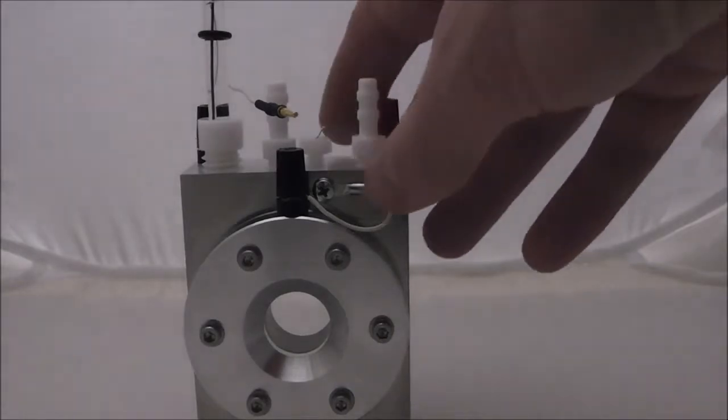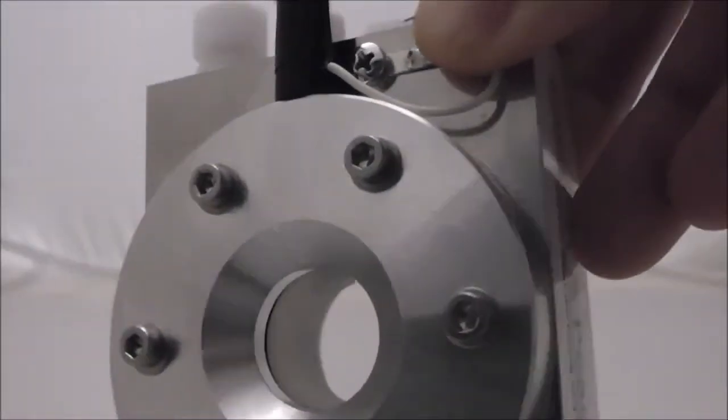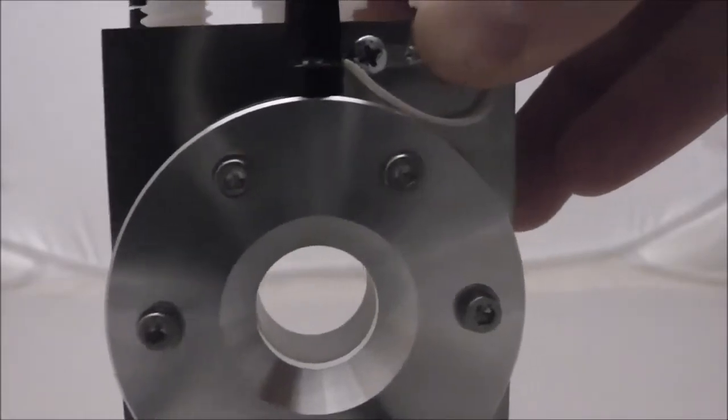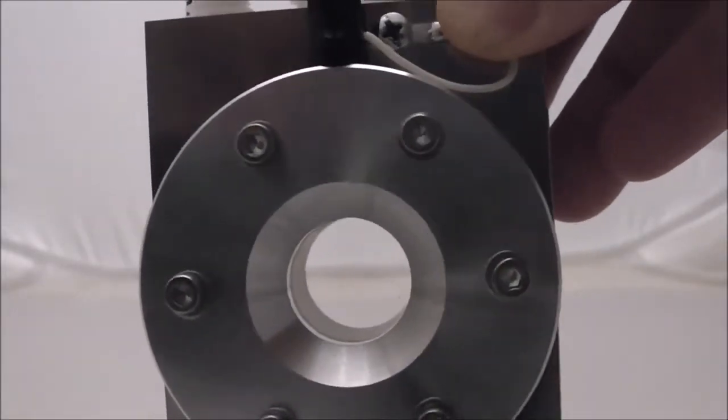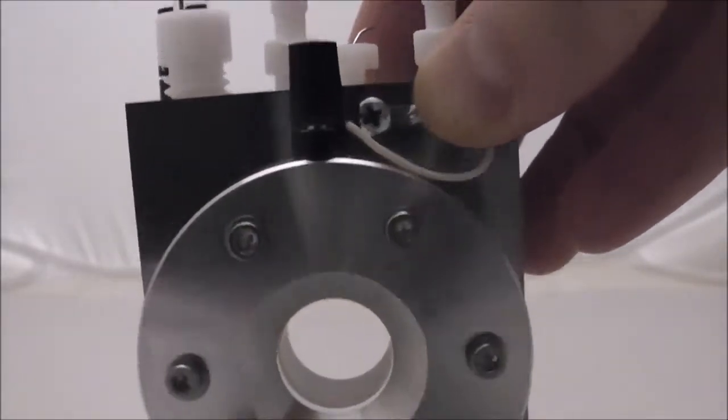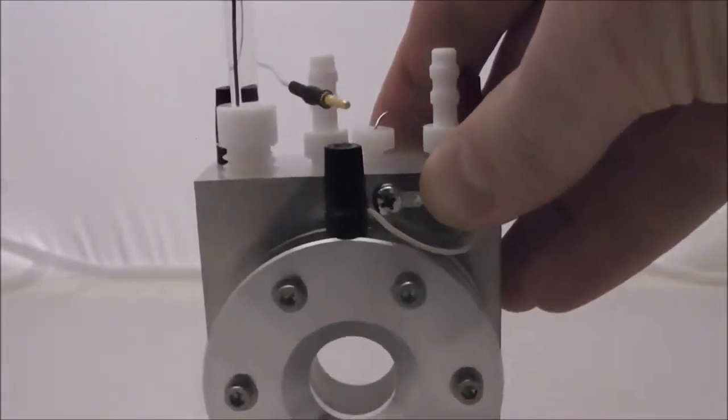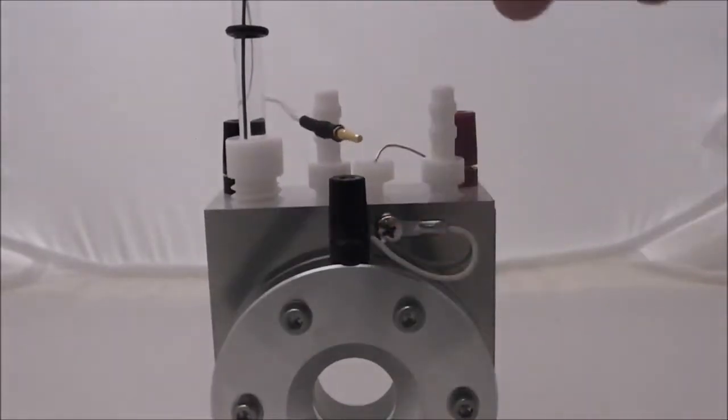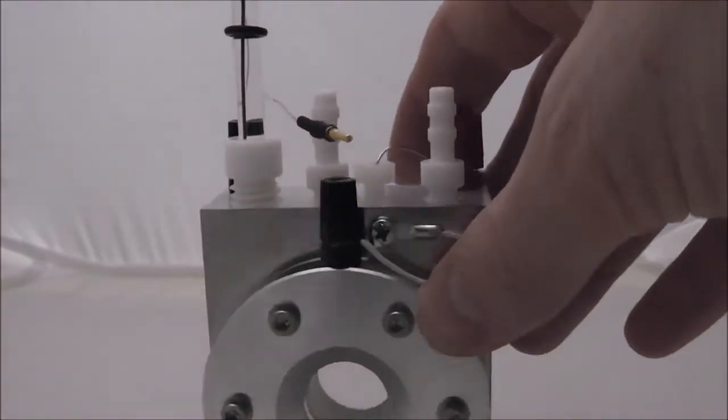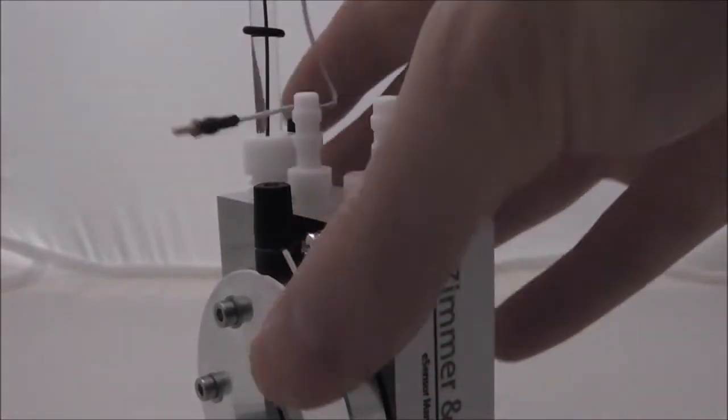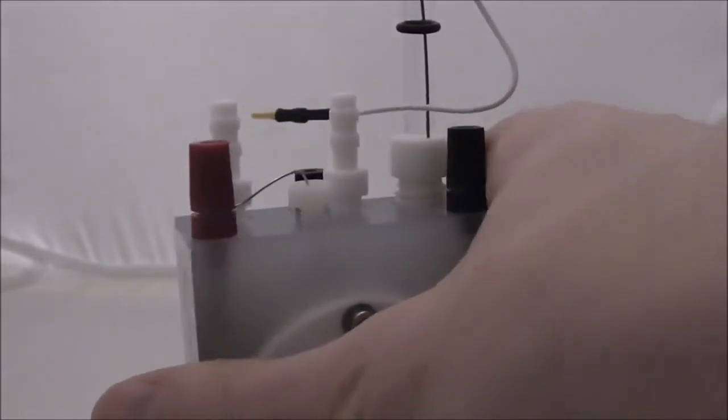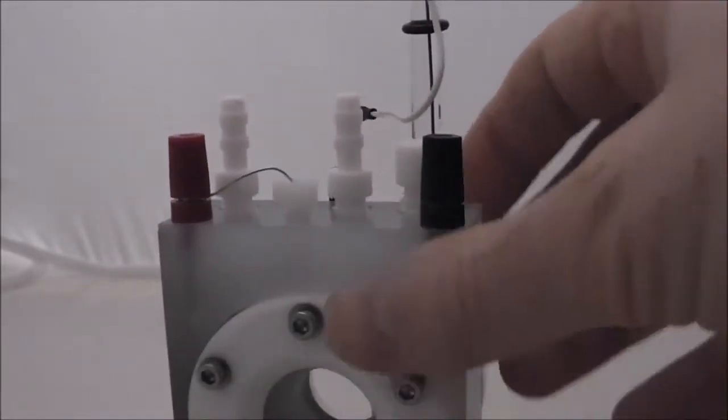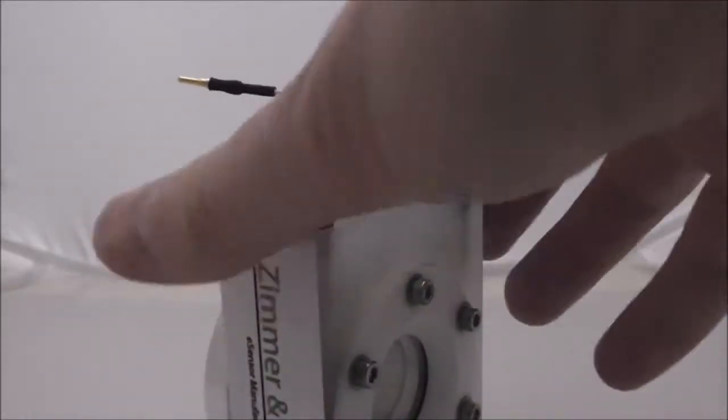In summary, there's a cell in here which you can fill with your electrolytes and your electrochemically active components. There's a platinum wire which connects as your counter electrode, a reference electrode that comes with it, and you can put your working electrode in there. You can make good electrical contacts. The whole cell is grounded if you wish it to be as well.